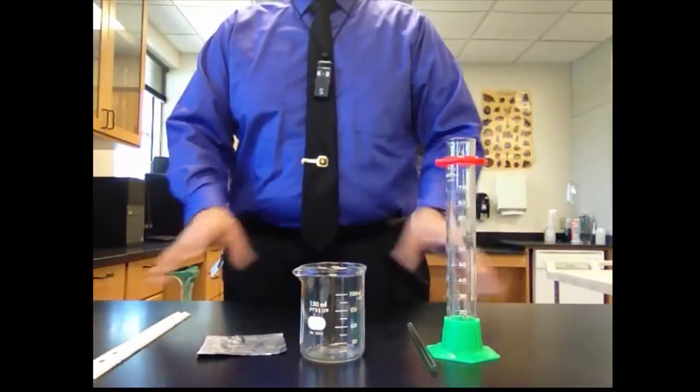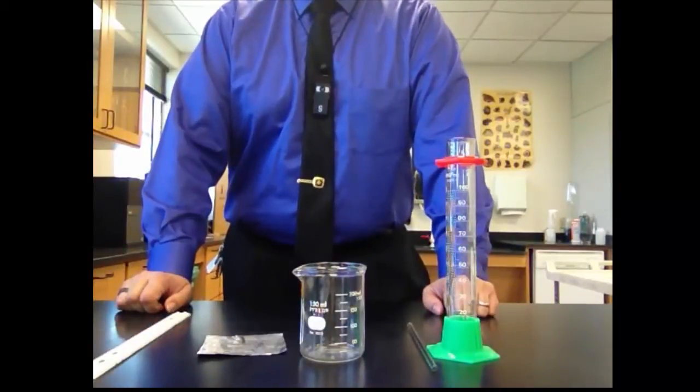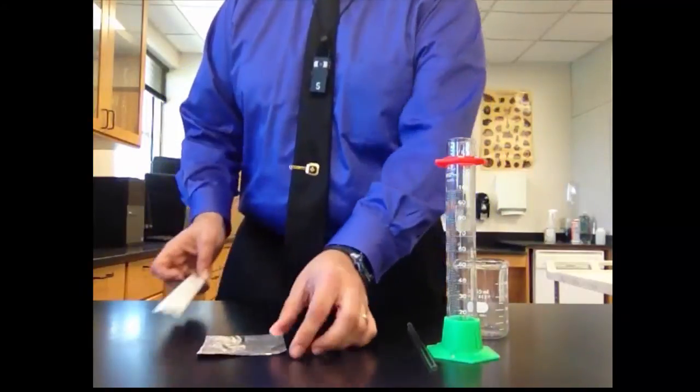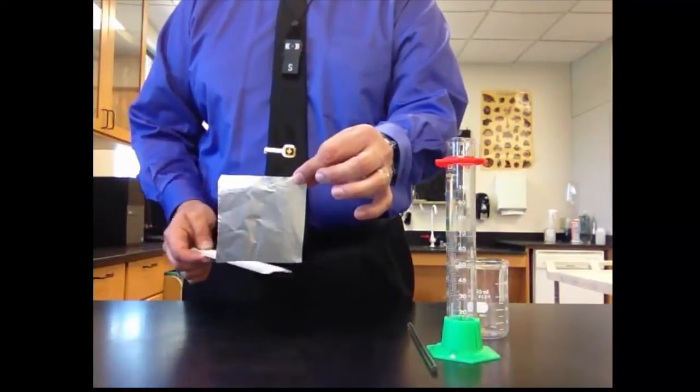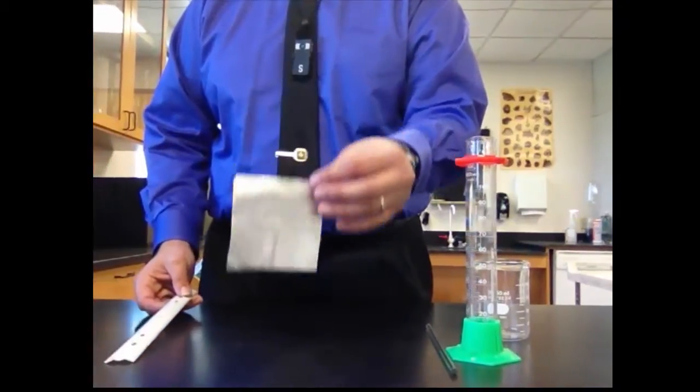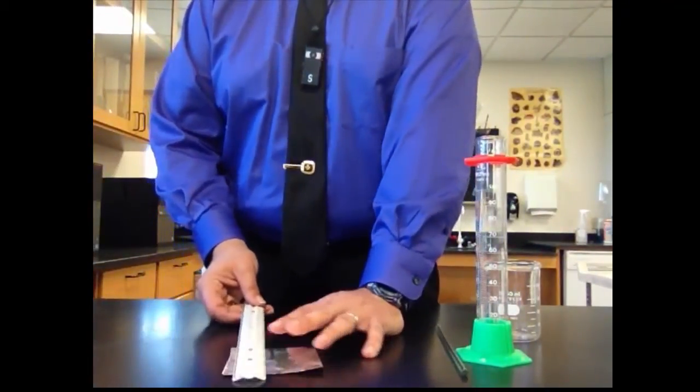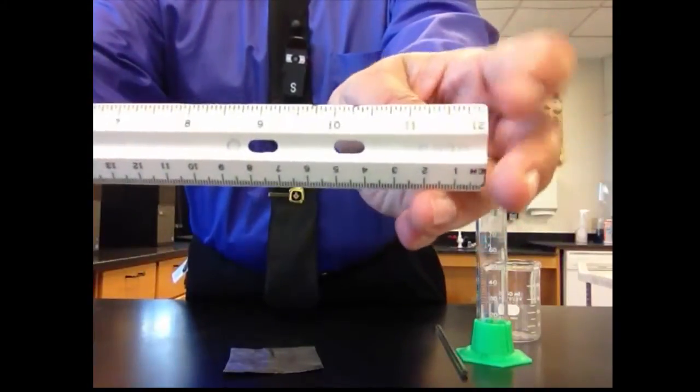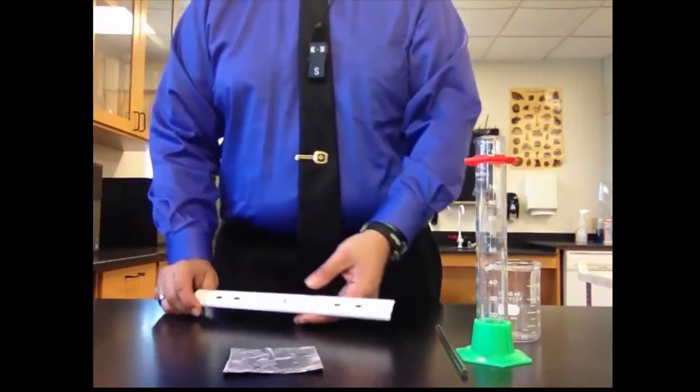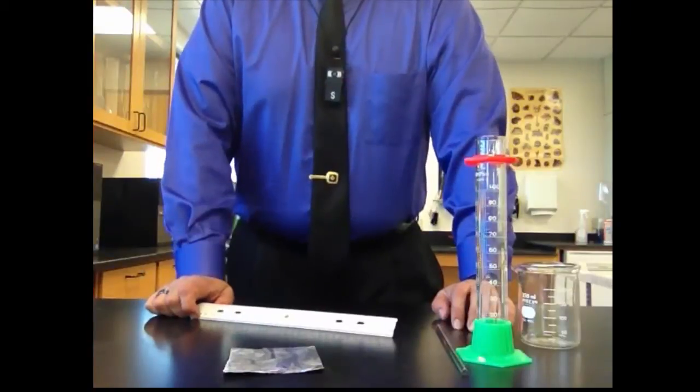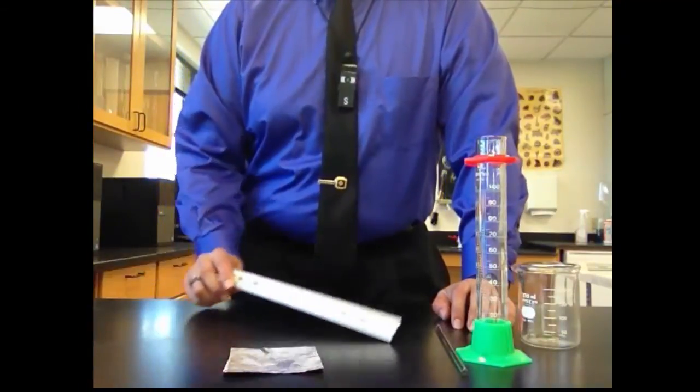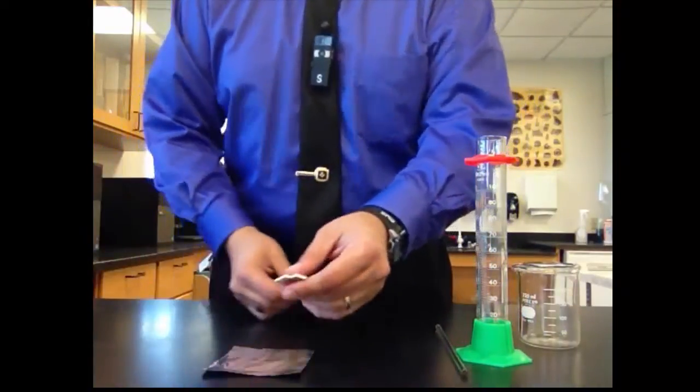Very simply, the first section of this lab is just measuring a few things about aluminum foil. With the centimeter ruler, you are going to measure the length and width of your square of aluminum, or rectangular piece of aluminum. These rulers, most of these rulers have inches and centimeters. And you're going to be measuring them in centimeters. Try to be as accurate with your measurements as you can.